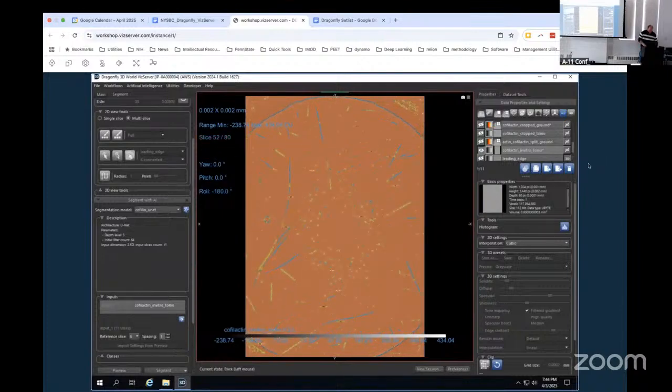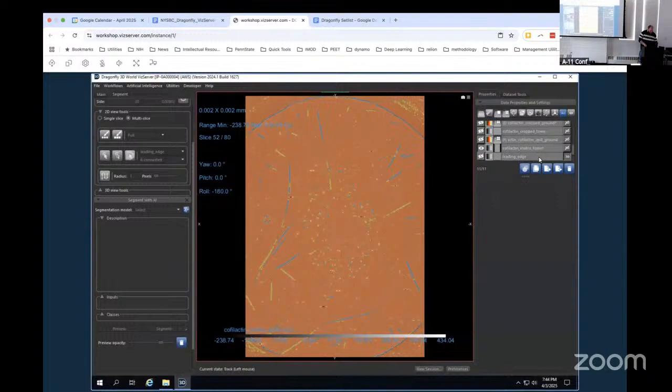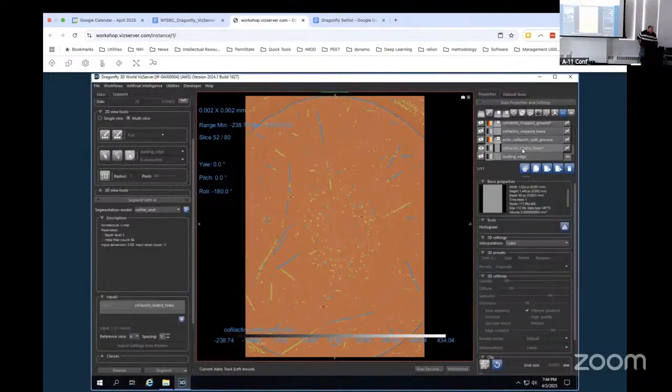Okay, let it go. Let me show you. I did this at home with this exact same data set, and I cleaned it up.